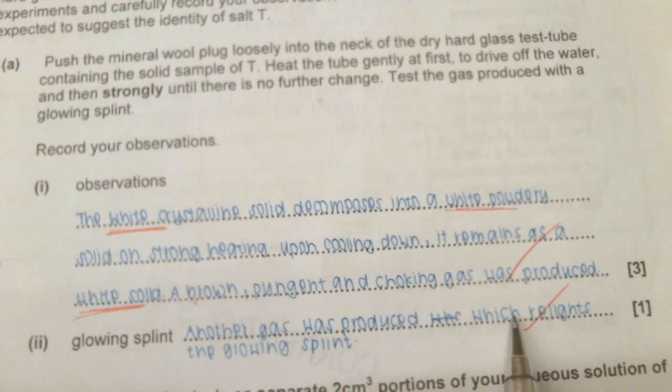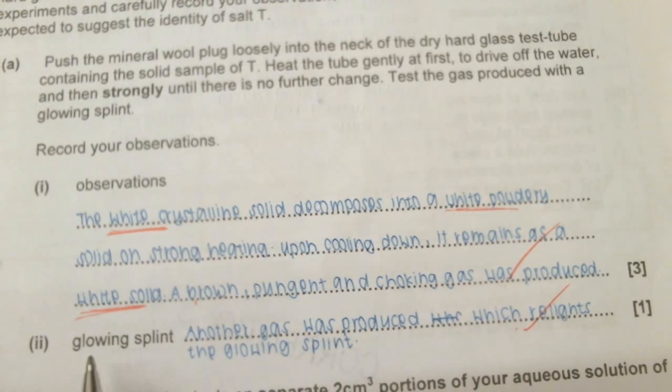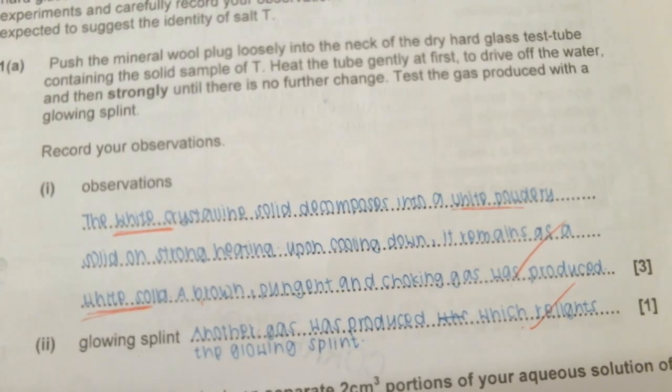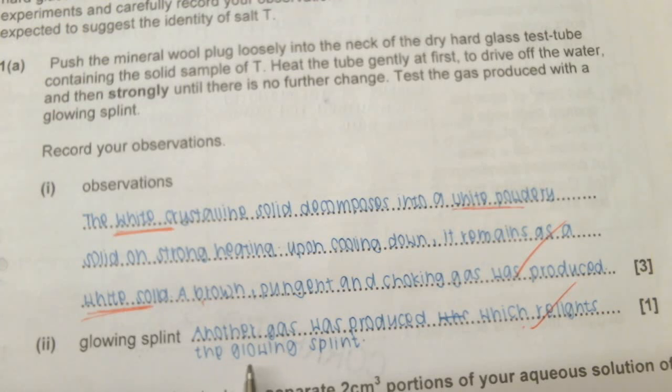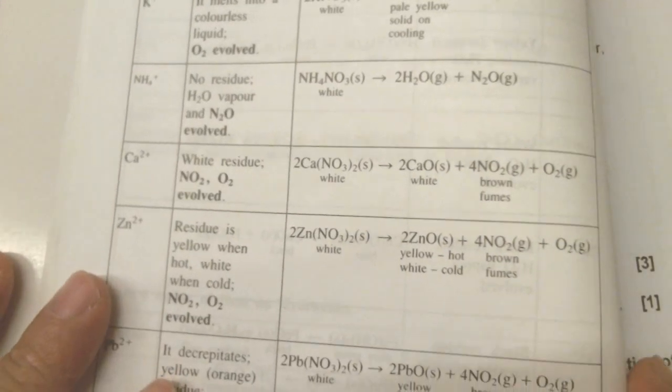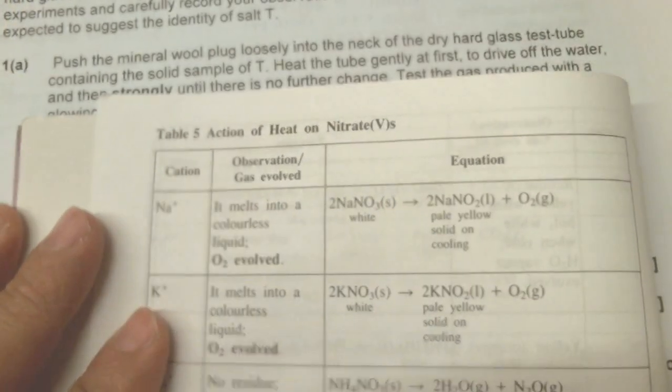Now from here, we can tell a number of things. One of the gases is brown in color, and the other gas relights the glowing splint. Do you know which gas can relight the glowing splint? Yep, it has to be oxygen. So when we heat something strongly and brown gas and oxygen gas are involved, we can safely say that it's a nitrate. And if you look at this reference over here, that is the reaction when we heat nitrates.